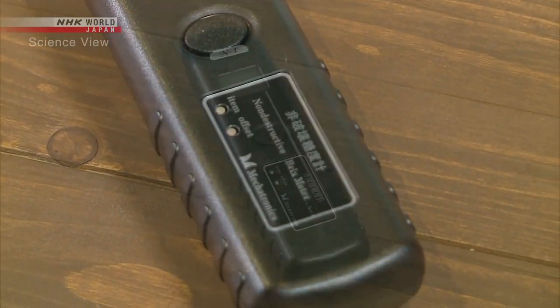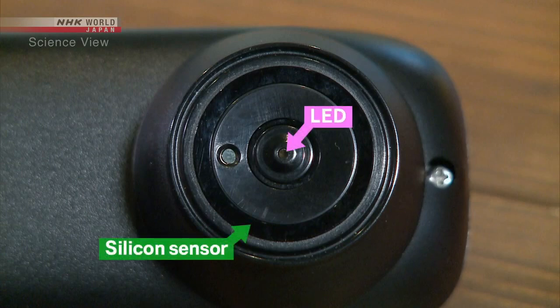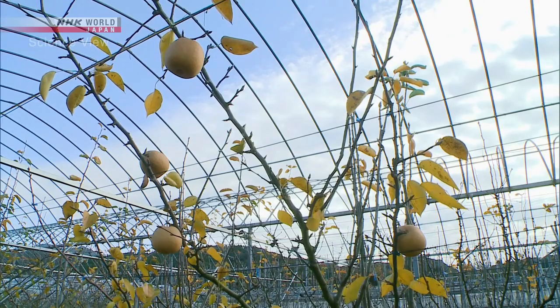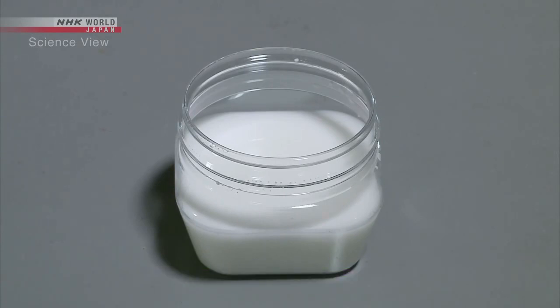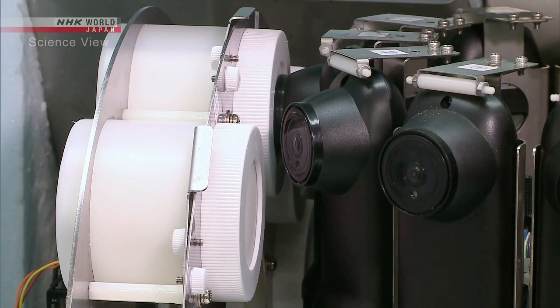After five years of development, the saccharometer was largely complete, but there was still another step. Since the device uses a commercial LED, there can be differences in the light's wavelength. Each and every one of the devices needs to be adjusted so as not to have any margin of error. That means fruits are needed to test the device, but having fruit with the right consistency on a regular basis is almost impossible. To address this, he succeeded in creating liquid specimens to use instead of fresh fruit. The Takumi created the liquid by adding a special combination of fructose with dietary fibers, giving it the same condition as real fruit. After setting the special liquid samples and the saccharometers on a machine and running tests, the devices are ready to be sent off to farmers.